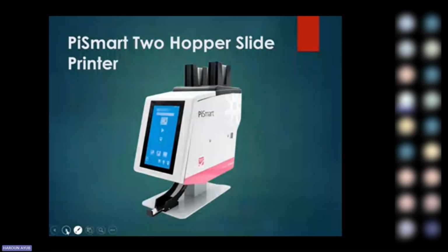Now, the other part is on slide printing or cassette printing. So remember, currently, if you are using the manual method of labeling the cassettes or the slides, you can still have an automated process. So for the slide printers, we have 2 hoppers. So here you can just load your slides. So remember, just pick the slides from the box, load them here, and load them on the 2 hoppers if you are so busy. And this will be able to select the printouts for these particular slides. So you'll just get your slides printed out here.